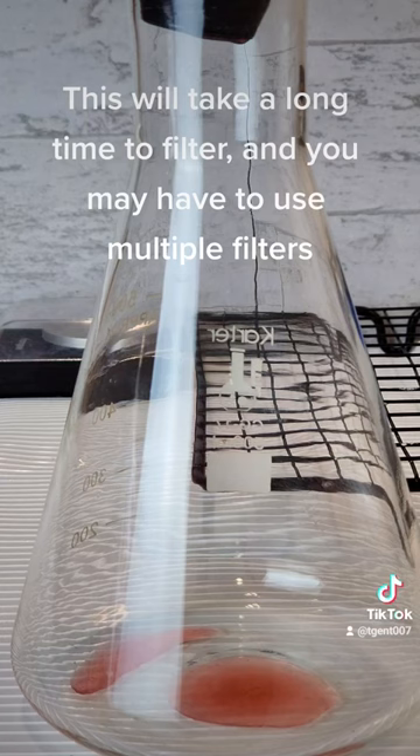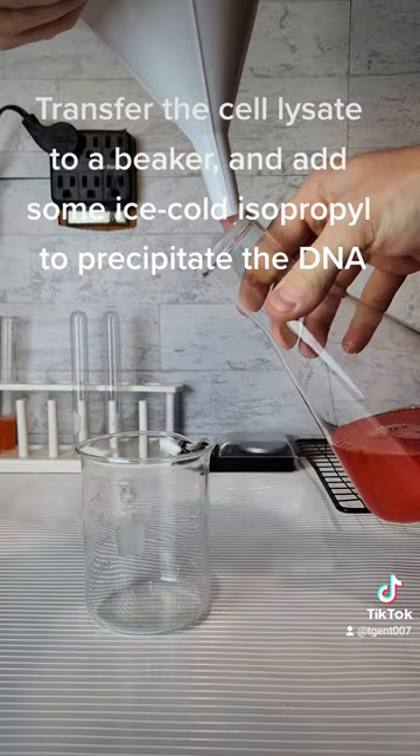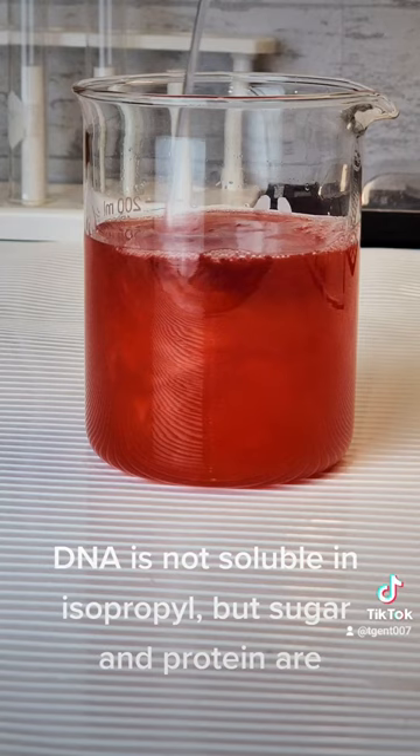After 5 hours, I have a good amount of cell lysate solution. Transfer the cell lysate to a beaker and add some ice-cold isopropyl to precipitate the DNA. DNA is not soluble in isopropyl, but sugar and protein are.